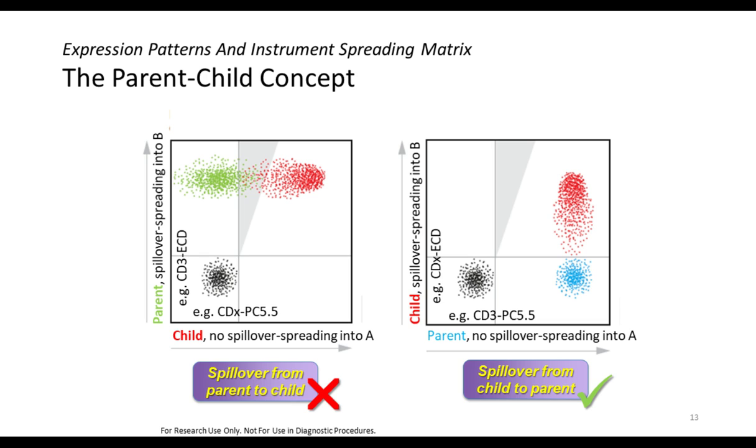So following our idea of matching antigen density with fluorochrome brightness, we have chosen here on the left the ECD dye to detect CD3, the intermediate brightness, and the very bright PC5.5 we have chosen to use for the co-expressed modulated antigen here in this case.